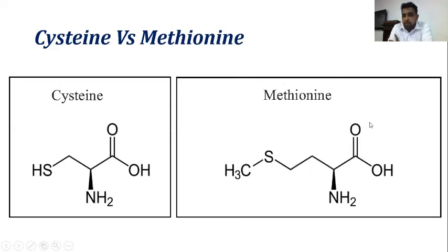So basically, the sulfur test is to identify cysteine amino acid containing proteins or cysteine amino acid. We can use this test to distinguish between cysteine and methionine, or cysteine versus other amino acids. Is that clear? Don't mix that. Cysteine and methionine both do not give the same result for the sulfur test. The reason is that only cysteine contains terminal sulfur which can react with Pb2+. In methionine the sulfur is in the middle of the structure, so it is hard to react with Pb2+. So only cysteine will give positive results in this reaction.